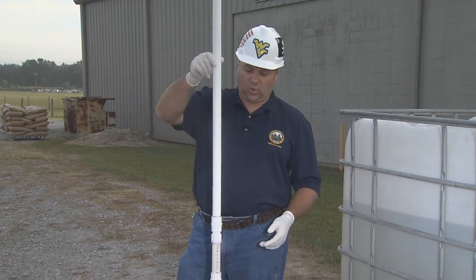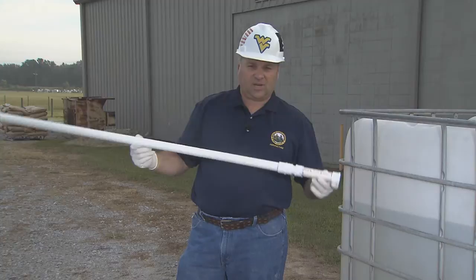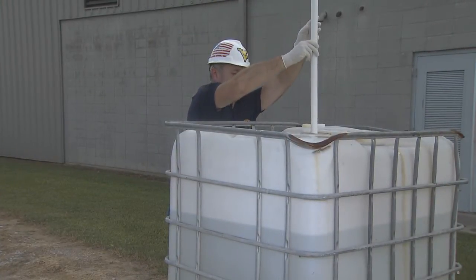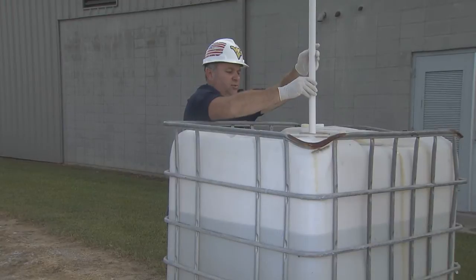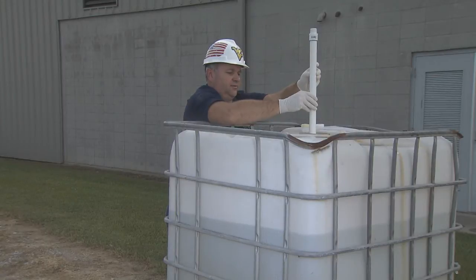You drop the core in, pull it out, put it into your sample vial. I'll demonstrate that now. You want to drop the core in slowly, so it pushes the valve up. You drop it in all the way until it touches the bottom of your tote.